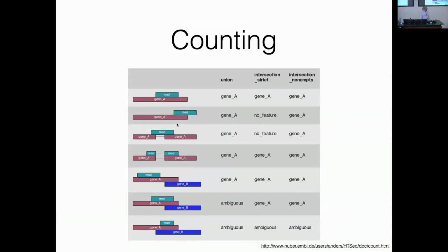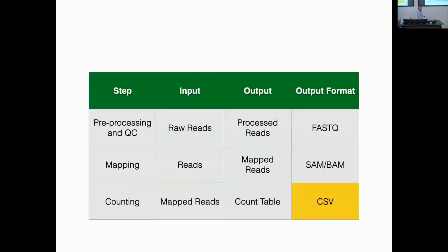But I have seen cases where weird stuff like this can actually create problems. For example, a lot of software, if it's like this, will just throw those reads out, but sometimes those are actually interesting data that you miss out on if you don't realize that some of the data is getting thrown out.